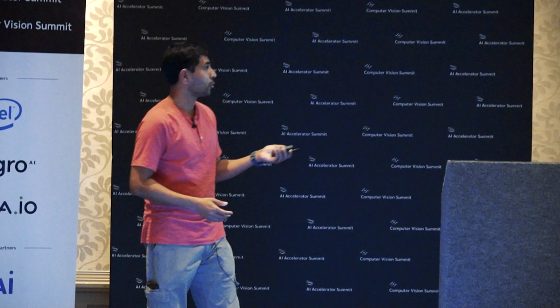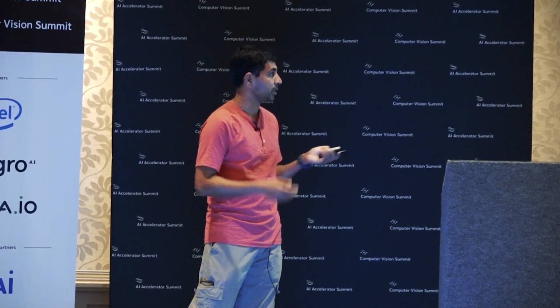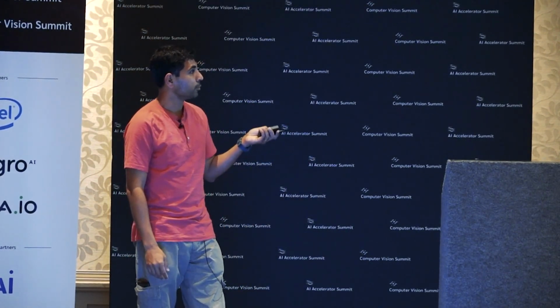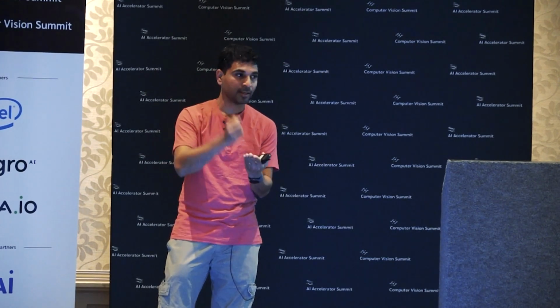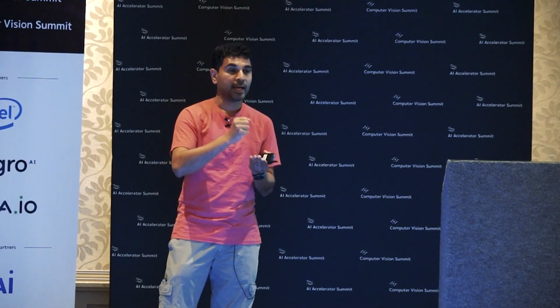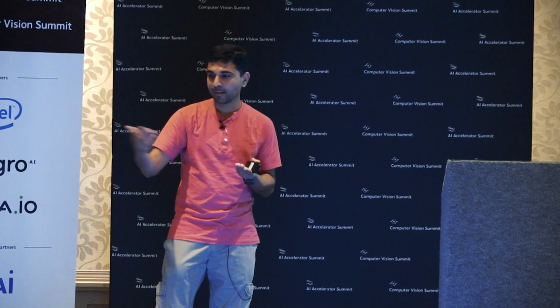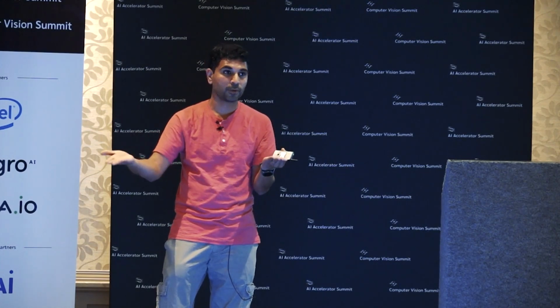So there was this model that was put out by the Allen Institute from MIT, and Google has an equivalent model in 2D, where essentially they are saying that if you just give a stack of bright field images, where the cells are just imaged using incandescent light, so that doesn't kill the cells and they are happy. And you train it on a pair, let's say you shine laser light on these cells and you create a fluorescent image. So now you know what the bright field image looks like, and you know what the registered fluorescent image looks like.